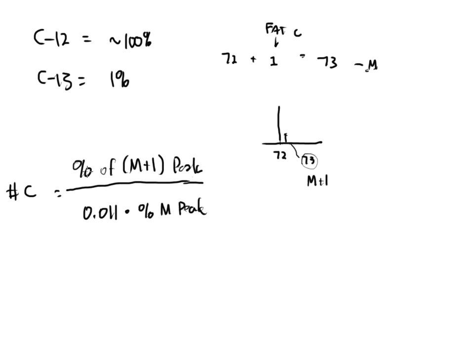These are the numbers straight from the mass spectral data system that prints off on the report. It's going to be right there in the table. No big deal. It's going to give them to me. I take those percentages and I divide them. However, I've got to remember I have to multiply that bottom number by 0.011. Why 0.011? Because carbon 13 shows up about 1.1% of the time, and 1.1% is 0.011. All right, so that's where that multiplier comes into play.